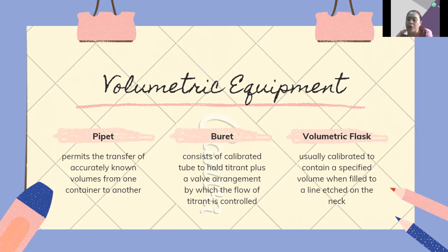Now, when is the time we use the volumetric flask? We use this one if we are going to make our own solution. Okay? So just like what we have computed sa lecture, like you will be asked to prepare a certain concentration of sodium hydroxide with a certain volume also. So dito natin siya i-prepare sa volumetric flask.